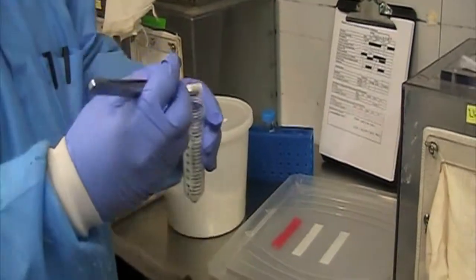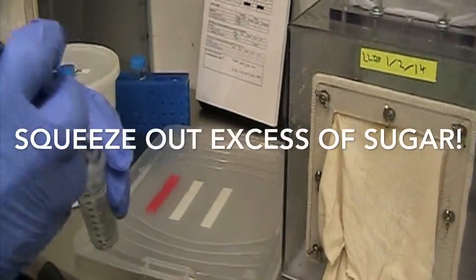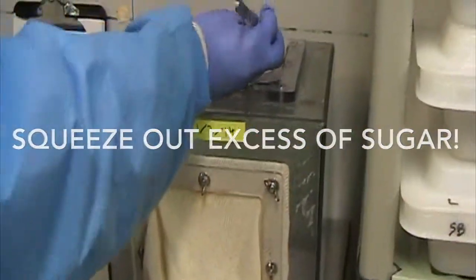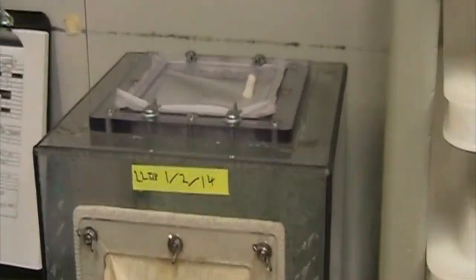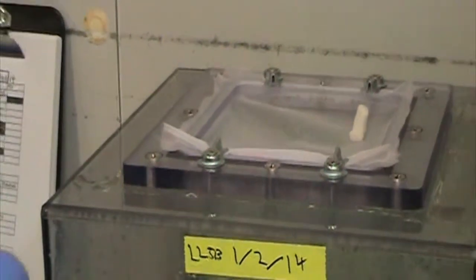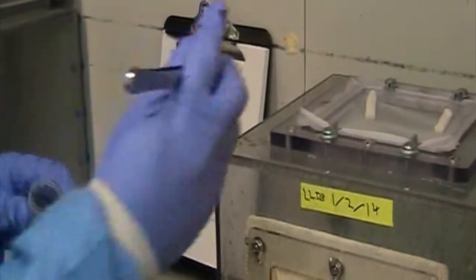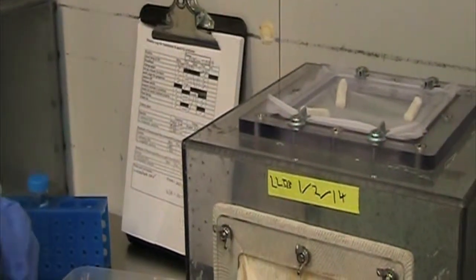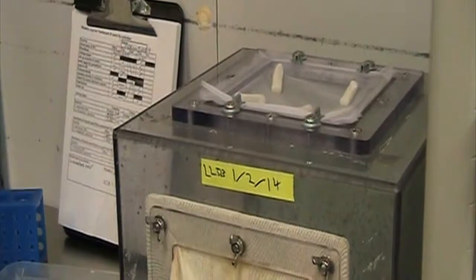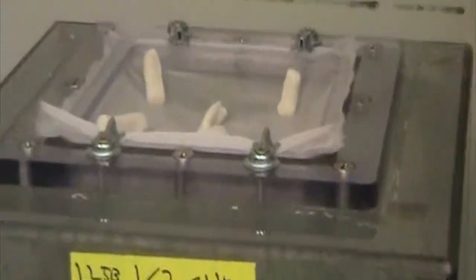Then you grab the sugar-soaked cotton cord from the falcon tube and squeeze it out against the side of the tube. You don't want any dripping sugar water on top of your cage. You don't want to squeeze it too tight and remove all the sugar, but squeeze it just enough so there's no dripping. Put it on the cage. I usually put two per tube — this is just a small demonstration of what we do.